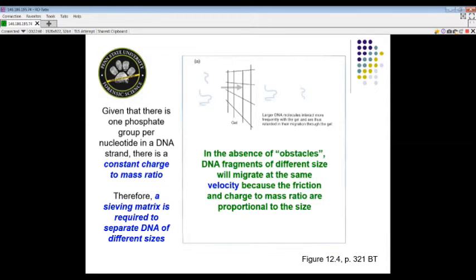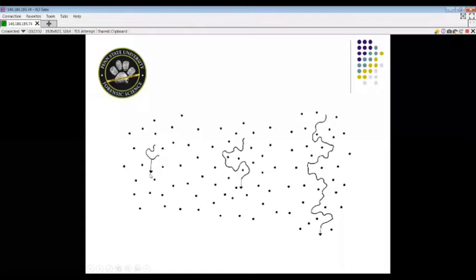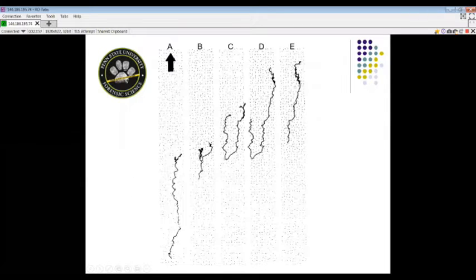We need those obstacles. And those obstacles, again, allow the DNA molecule to come through and navigate past them. If you're a small piece of DNA, it's easier to navigate. You can kind of clump up into a ball and move through pretty quickly. But if you're a big piece of DNA, it takes a little time to get through. And sometimes different portions of the DNA molecule are bunched up, and sometimes they're elongated. So it takes a while for a DNA molecule to figure out how to navigate through those obstacles.